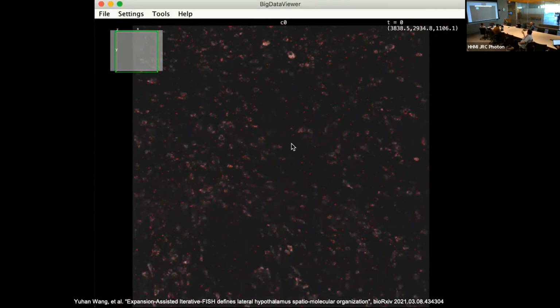Do you know if PALM STORM microscopy has already started implementing radial symmetry or non-Gaussian based fitting approaches? I mean, for these things, machine learning based seems to be the best. It will outperform all of this. But is that what's being employed right now in commercial systems?